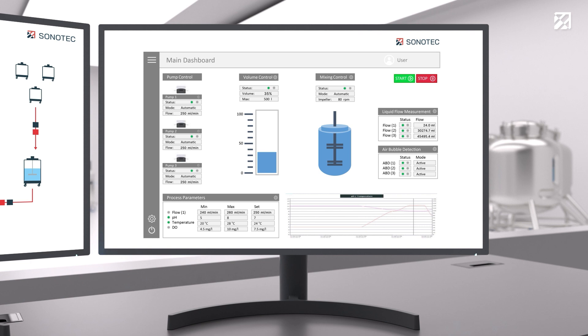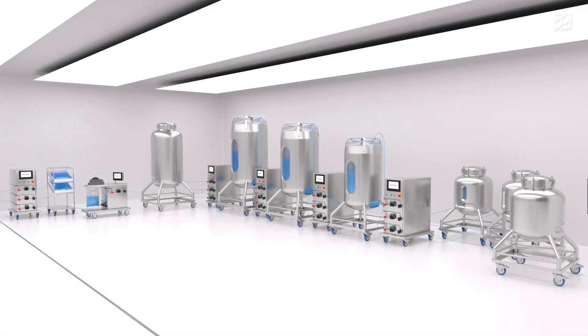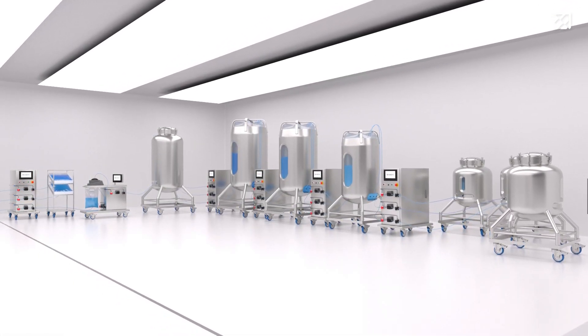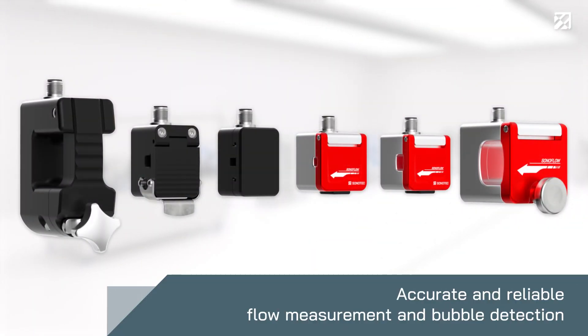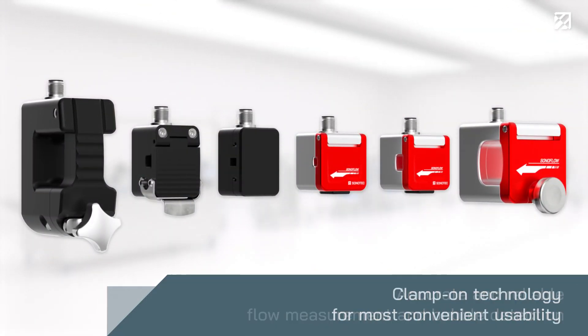As a critical process parameter, highly accurate real-time process flow and volume data ensures excellent quality and reproducibility for PAT-related bioprocessing. Contact-free sensors keep your processes stable, efficient, and safe.